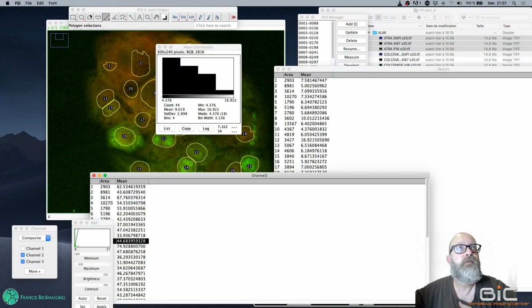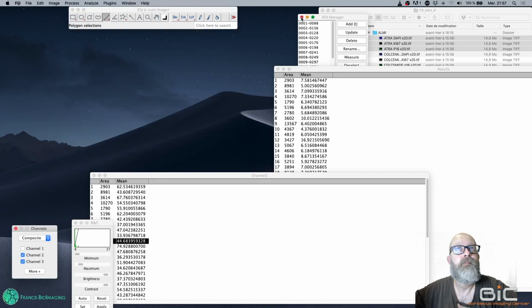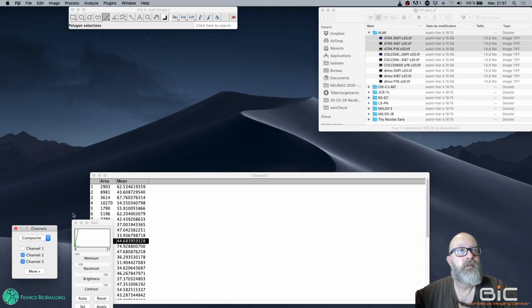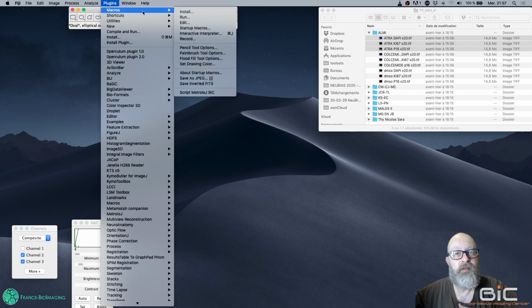I will close everything, all the tables, etc. And I will start a tool that you find in plugins, macros, and record.